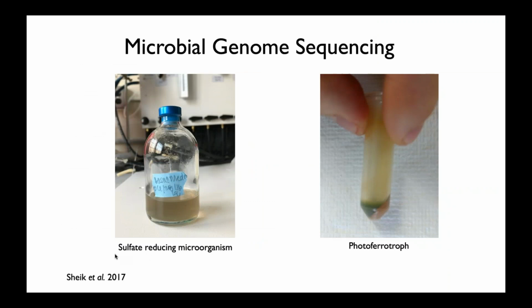And so it's been used in numerous papers since its isolation because it's a very model organism for syntrophy. We were really interested in understanding this because we were going to use it as a lab culture, but it didn't have a genome. All this time, it's been spinning out in the wild, it had no genome. So this was my first foray into using PacBio sequencing just to see what it would do for us.